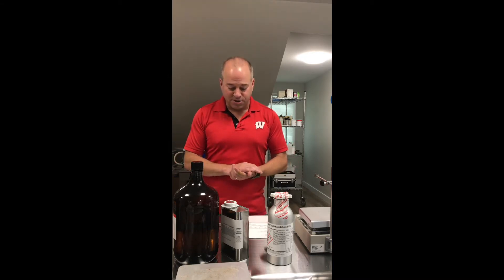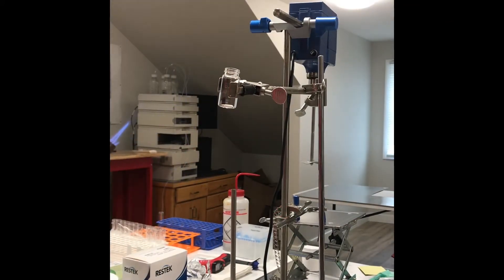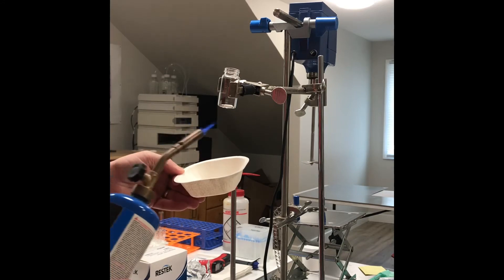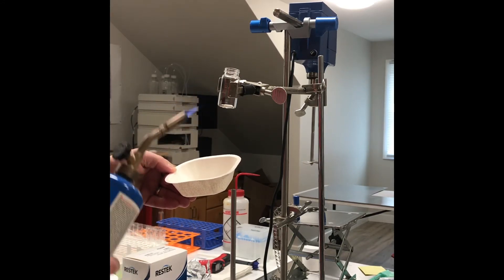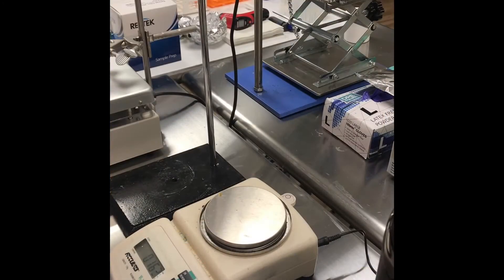Let's get this chemistry going and see how it covers. Since the chemistry is moisture sensitive, I am going to heat the glassware just to dry it. It might be overkill, but it's a good practice.